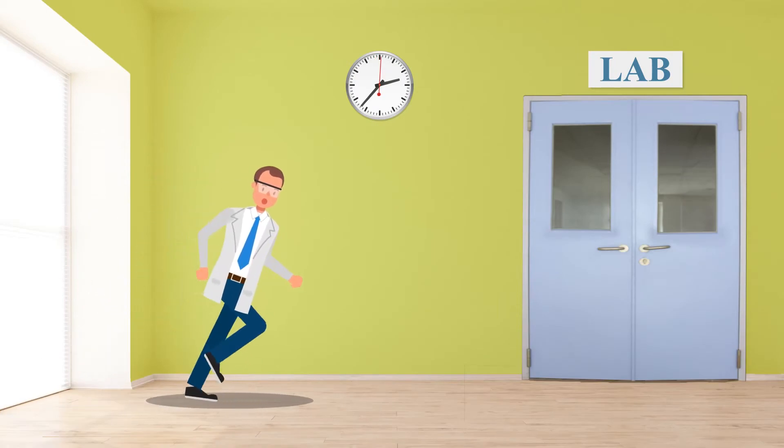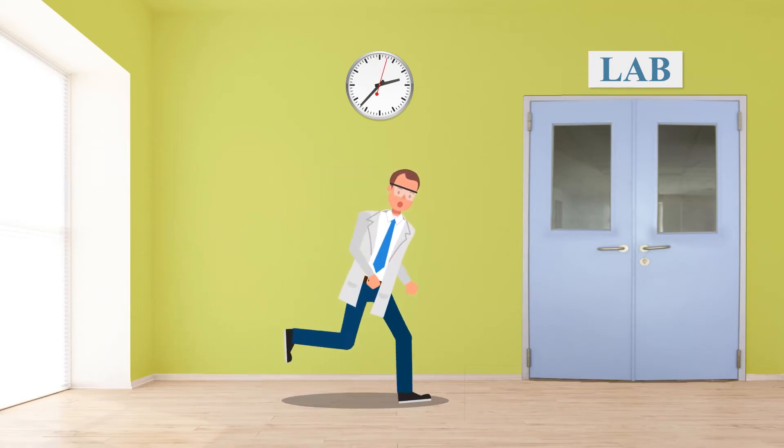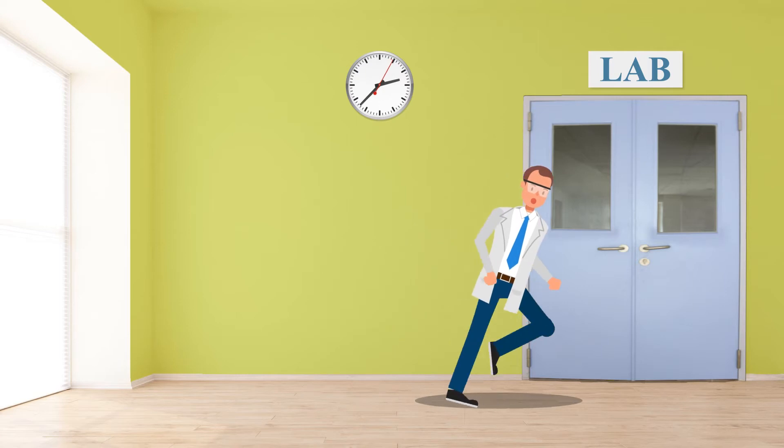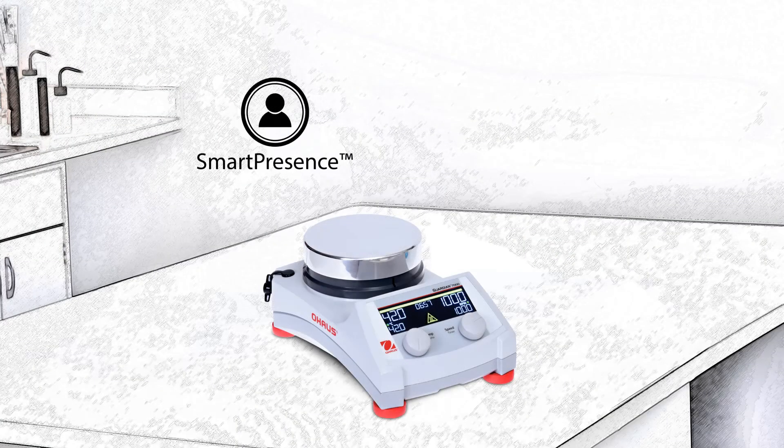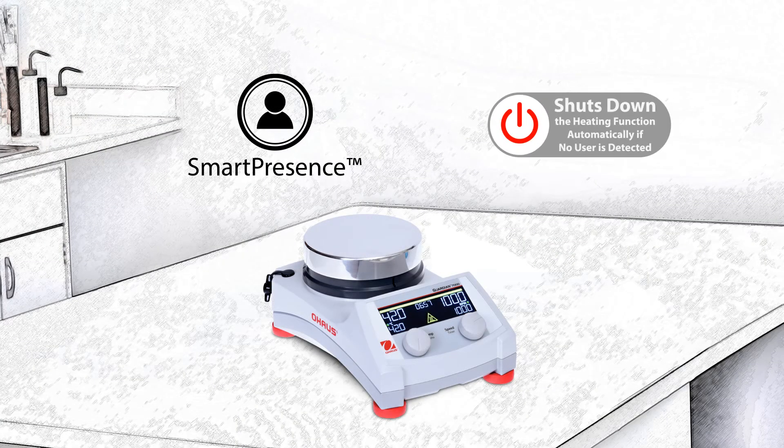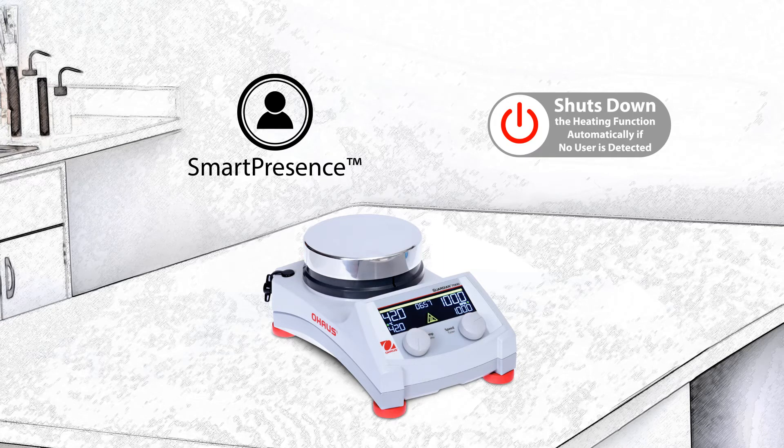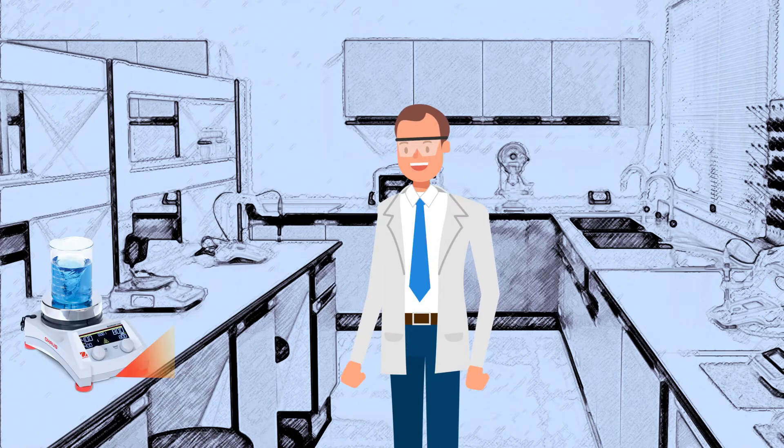Safeguarding lab operations is a guiding principle behind every piece of O-House laboratory equipment. Offering superior safety features and intelligent performance, the Guardian 7000 series hot plate stirrers feature Smart Presence, an exclusive IR-based proximity sensor that recognizes a user nearby.